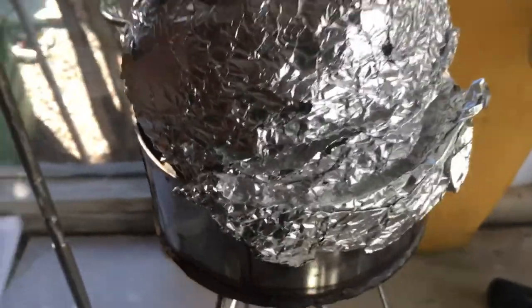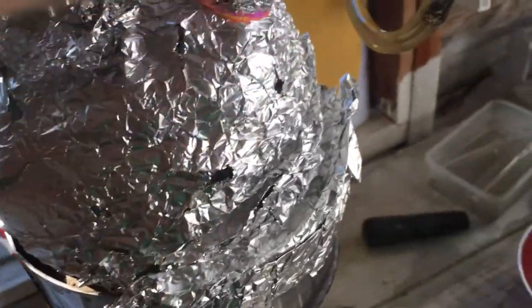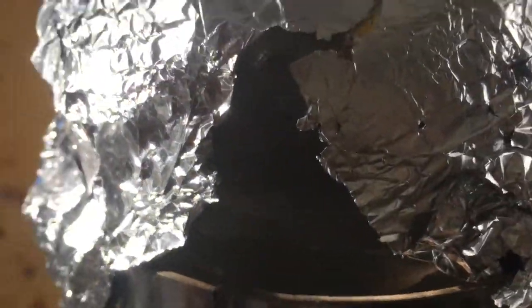And I have here a one-litre round bottom flask — boiling flask, I guess — two-neck. And basically, I have my 500ml of ethanol; I measured out 500ml of alcohol.